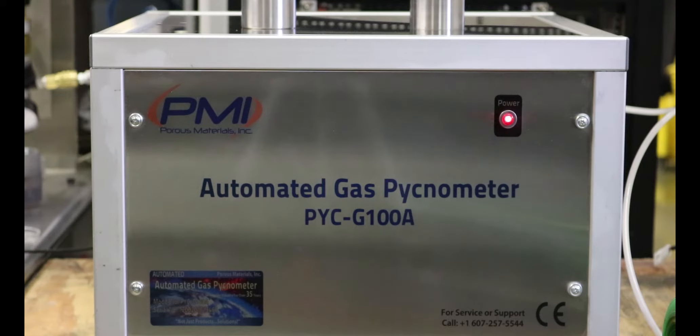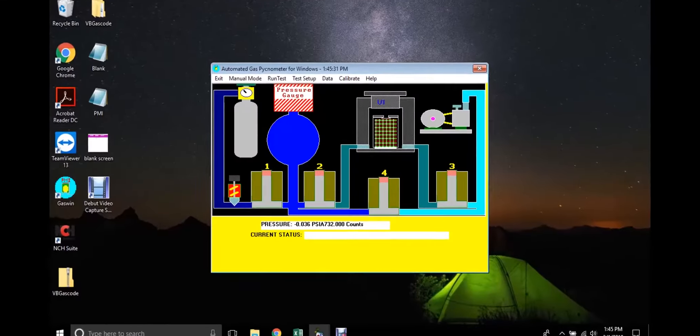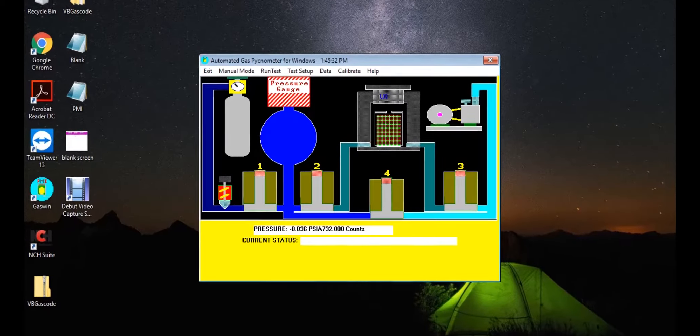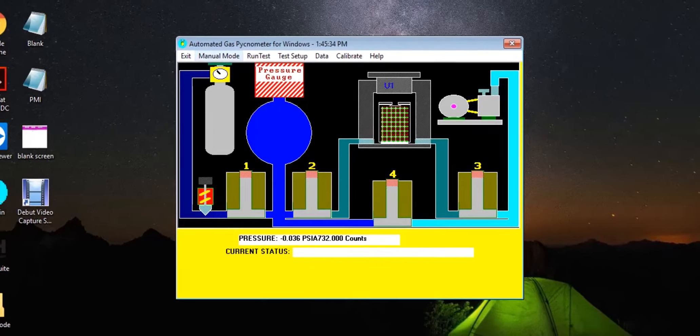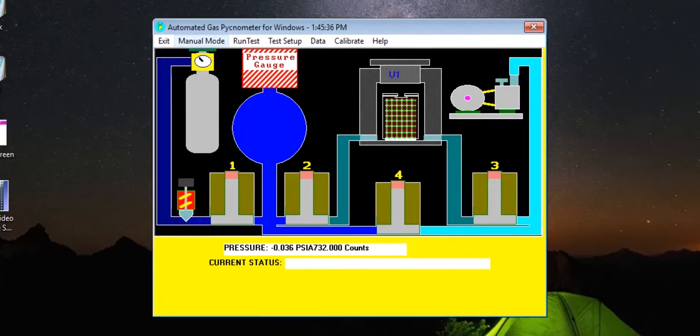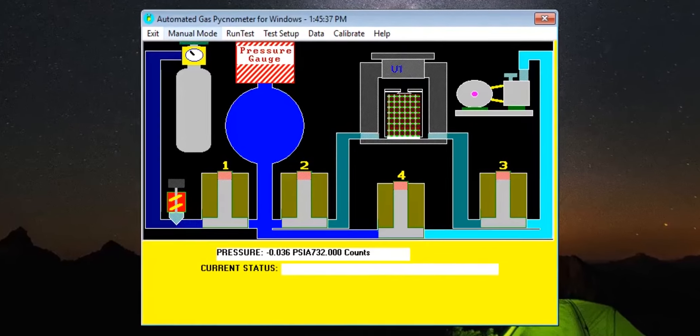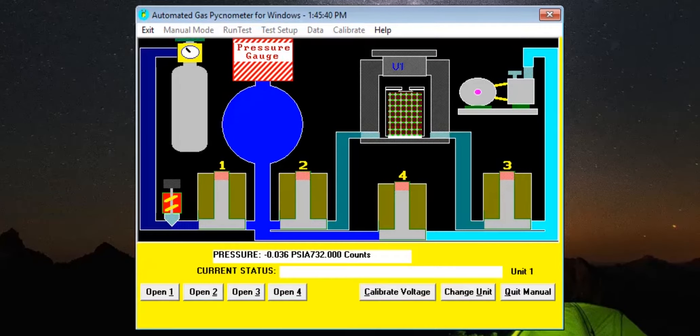The first action that should be taken is to ensure all parts are responding and functioning properly. To do this, open the software and click Manual Mode, located on the menu bar. This will allow control over the valves in order to test their functionality.